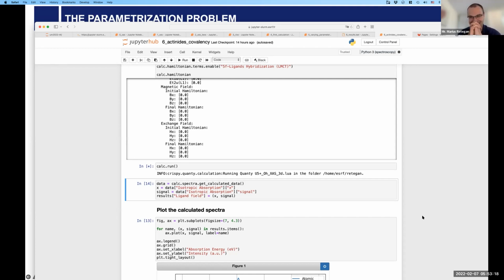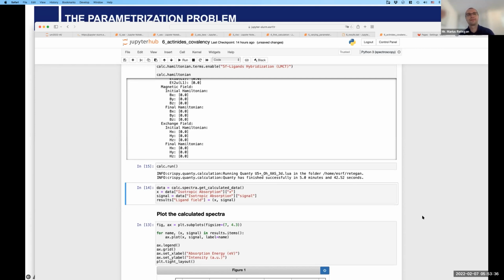I know that when you do your experiments, you follow exactly what you have done. I think for an online journal at the experiment, it's a very useful thing, and it should be really implemented, because then you can see what happened. It's not only documentation of what was done, but you can also see how the spectra look and how they developed. If something goes wrong, you see, okay, this spectrum got wrong, we have to remeasure, or you can see, does it look okay? And we decide whether we remeasure the sample or not. So for this, I see it very useful.